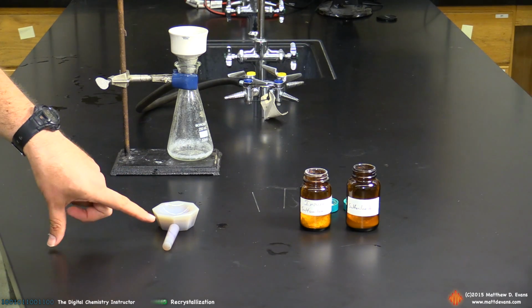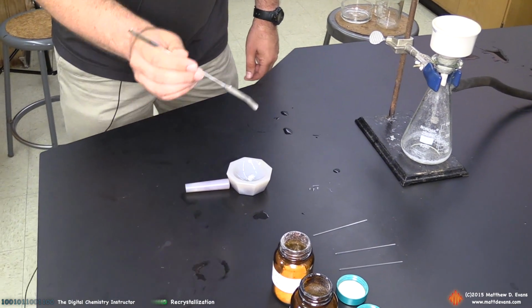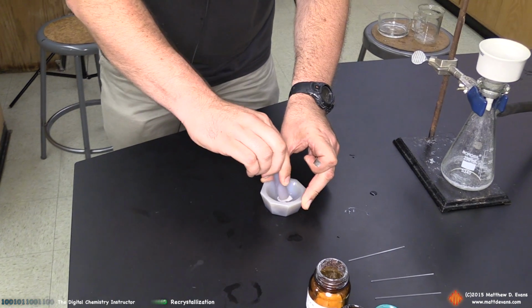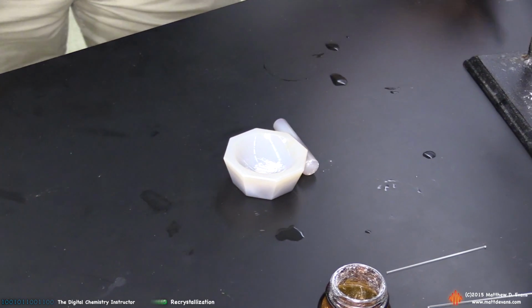So I've got a mortar and pestle available here. I've got one out, and I'm going to crush up some of these needle-like crystals. They're so pure that I'm just going to crush them down just a little bit so I can get them into the capillary tube. So I'm going to scoop this up a little bit just so I get a little neat pile. Make sure that doesn't roll off the bench top.